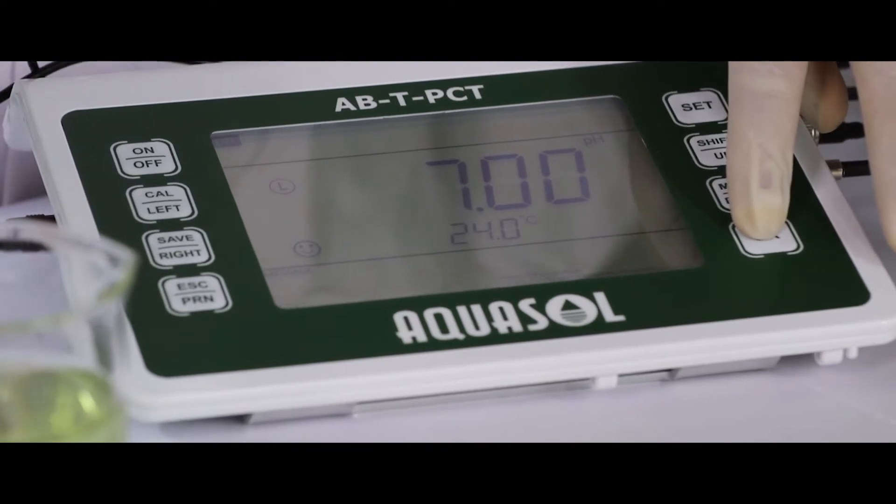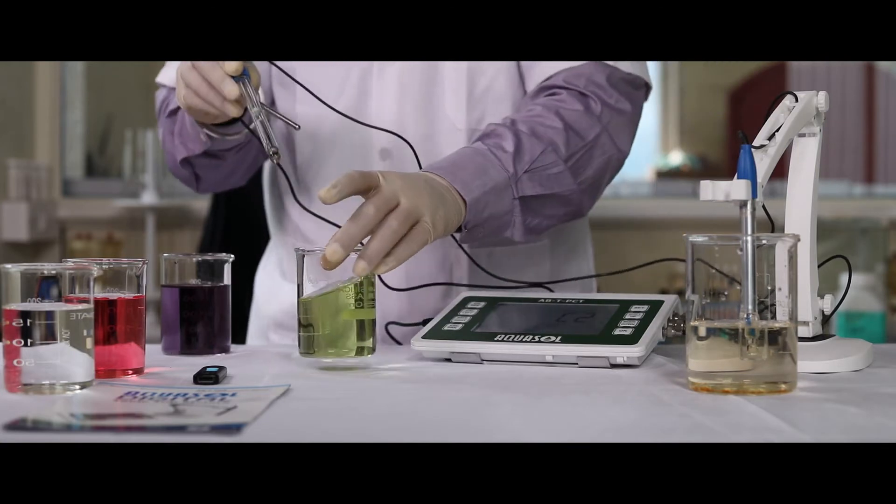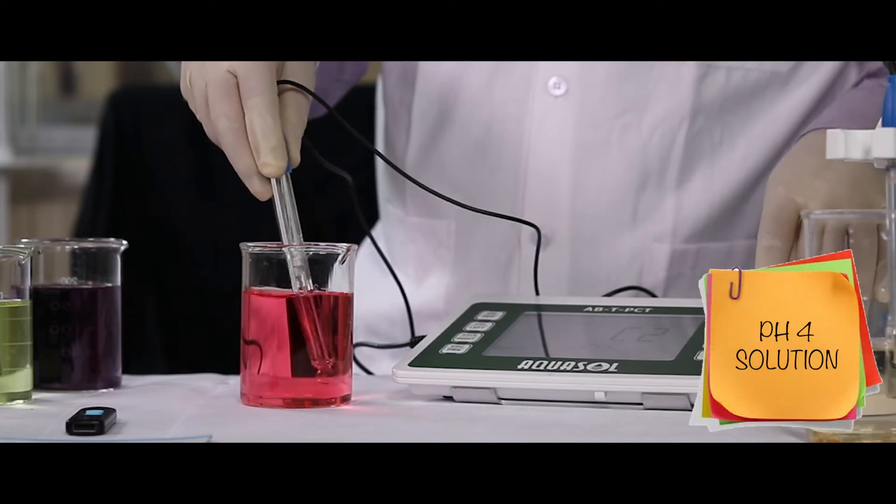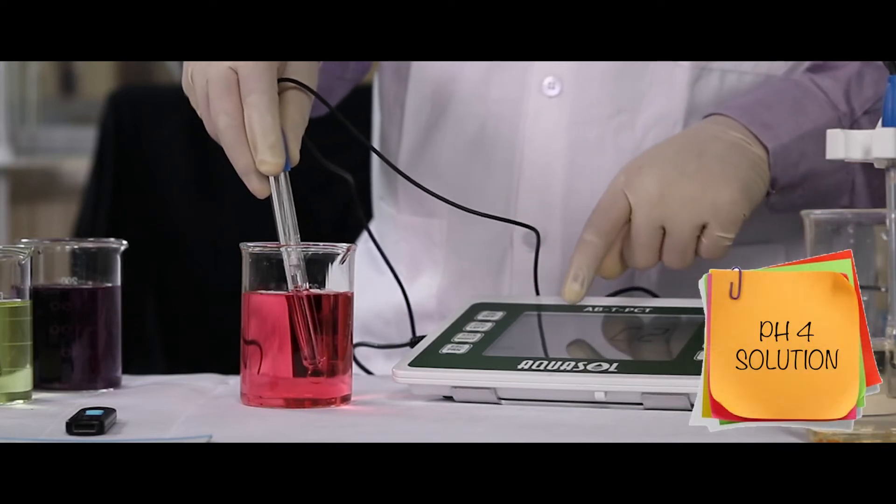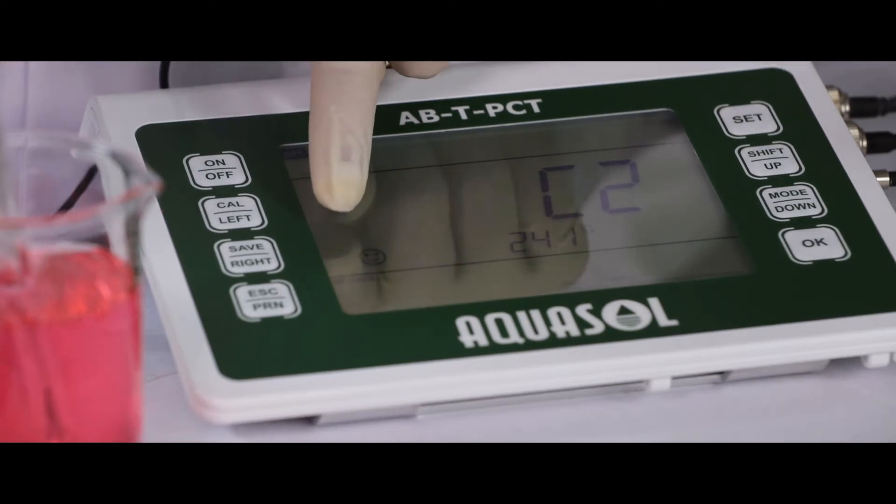The meter will ask for C2. Standard pH 4 solution is used for C2. Clean the electrode and dip it in pH 4 buffer solution. Once the meter displays smiley, press OK to calibrate.